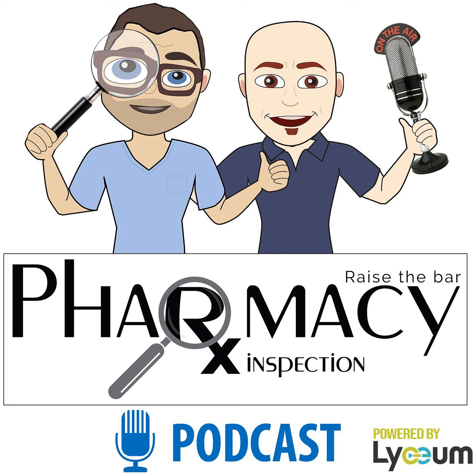Unfortunately, the 483 didn't detail whether or not the 15 CFU were identified, so this makes the investigation nearly impossible. Remember, without knowing at least the genus of the microorganisms found, there's no way to tell where they came from: people, materials, equipment, etc. In the improve phase, you'll want to test your possible causes of contamination.